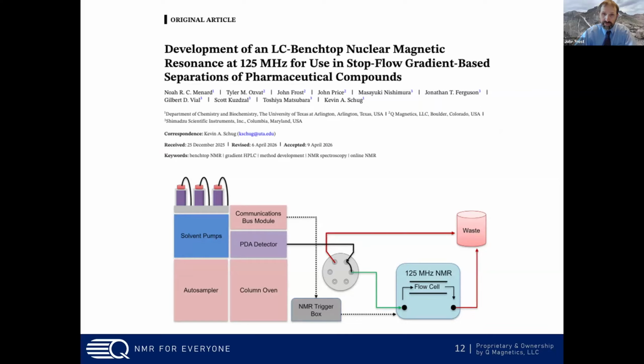And so it's really starting to bridge the gap and make benchtop NMR not just be an analytical tool for walk-up single application samples, where we're just trying to replicate how we treat the majority of high field NMR spectrometers, but on the bench.